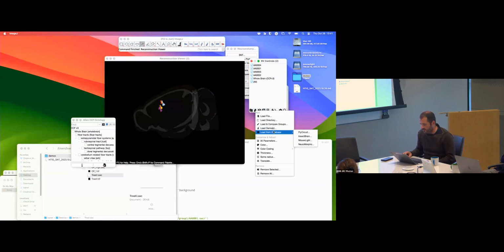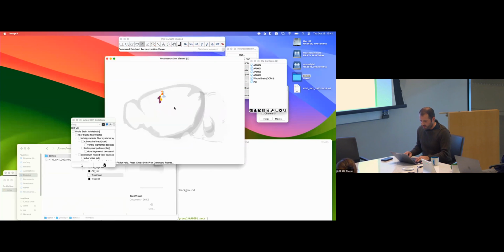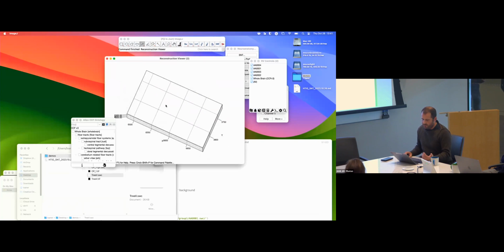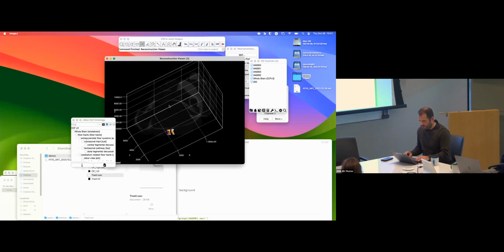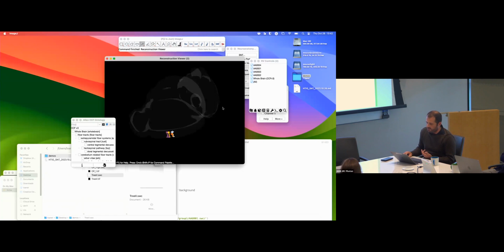So it's another entry point. And the reason I have this dedicated viewer is for two reasons. We wanted something that was easy to use and something that would allow us to do quantitative visualizations. I'll show you what I mean with that in a second. But just an overview: these also have single key shortcuts. You can toggle dark mode, you can toggle axes, you can make animations, you can zoom in, zoom out. All the stuff that you would normally do. I know it's unfair, but you probably don't see what I'm doing, I just know the shortcuts.